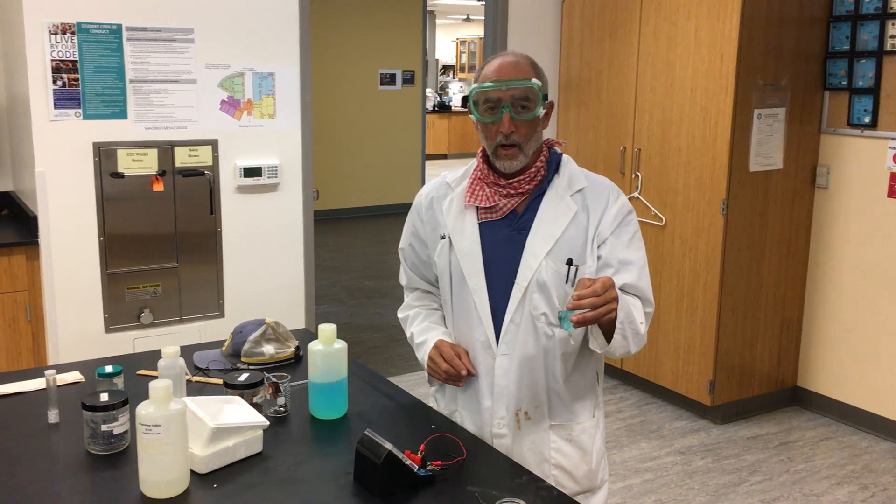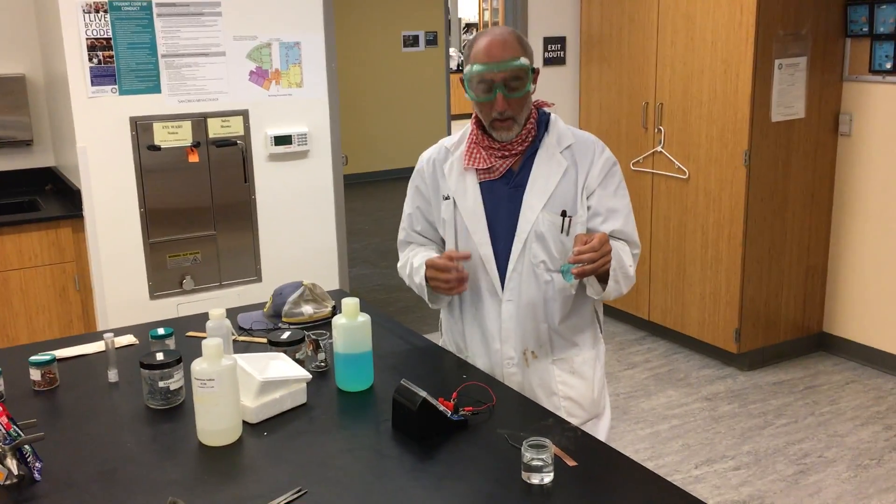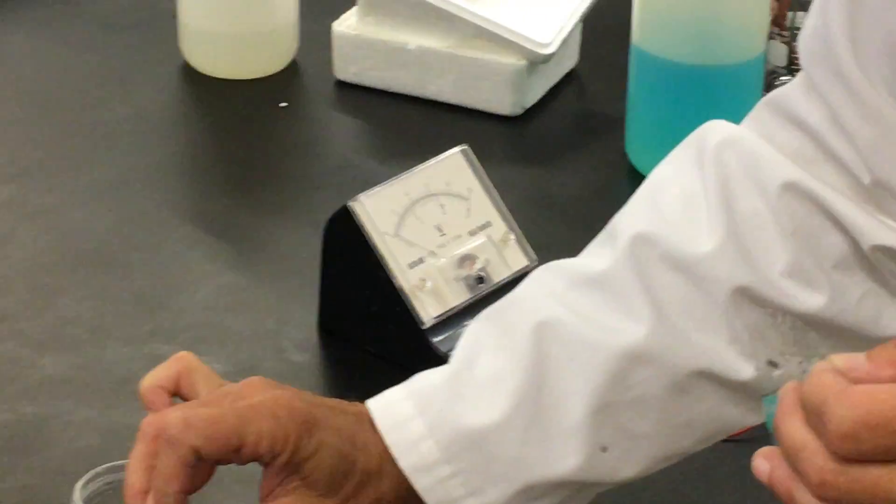All right, everybody. This is experiment 9, activity 2: making a battery. Because it takes more than two hands, we did a little bit of it ahead of time. So what we have here — this is a voltmeter. This is magnesium sulfate. This is a strip of magnesium. I'm going to put this in like this, just to let it sit out.